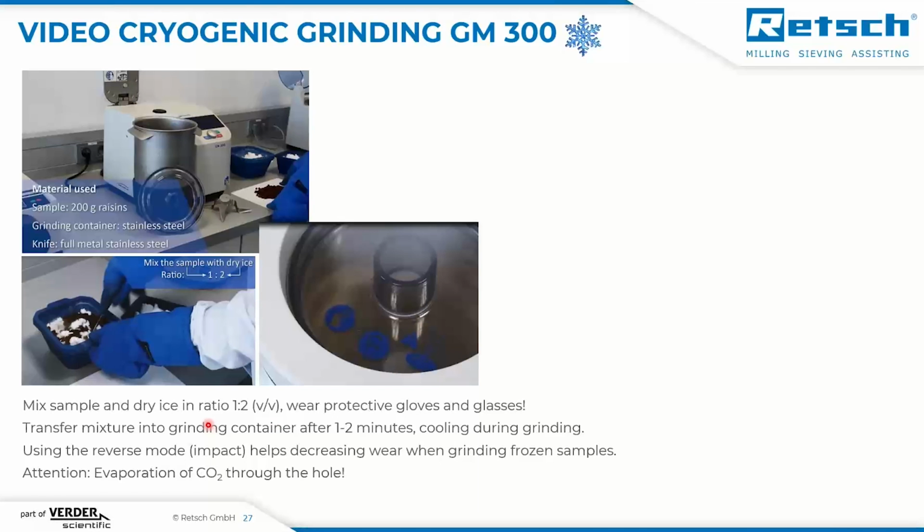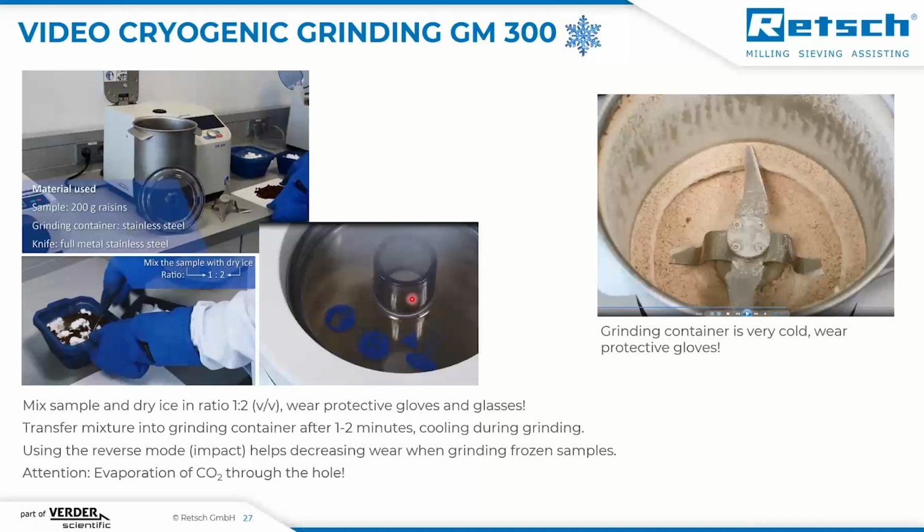Also very important, dry ice is frozen carbon dioxide, and when you have a little bit of warming during the grinding process, it tends to evaporate, and this will increase the pressure in the grinding container when it is closed. So we have to use a lid which has openings so that the carbon dioxide can just leave the container and will not lead to overpressure. So this is what the sample looks like.